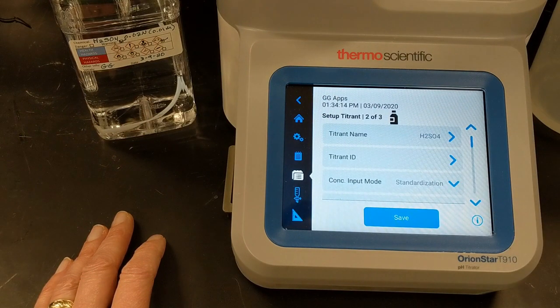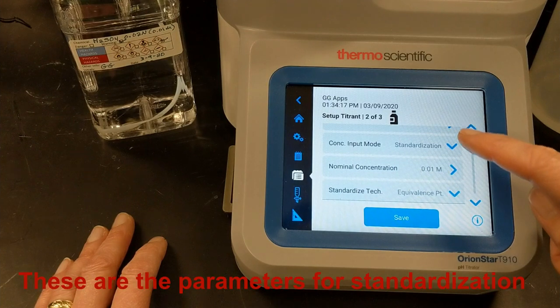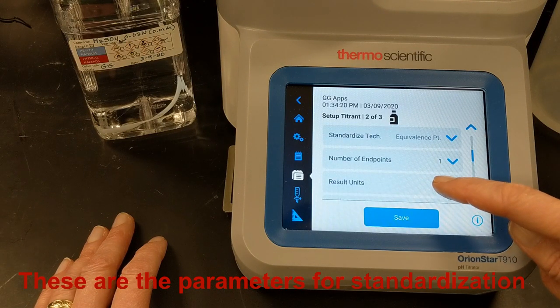My titrant is sulfuric acid, and I've chosen the option to standardize. But if I don't want to standardize, I would choose concentration input mode equals manual entry. The nominal concentration of the titrant is 0.01 molar, or 0.02 normal H2SO4, and the equivalence point technique will signal the endpoint. There's one endpoint in the standardization, and the result units are molar.